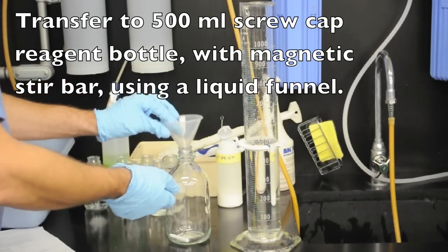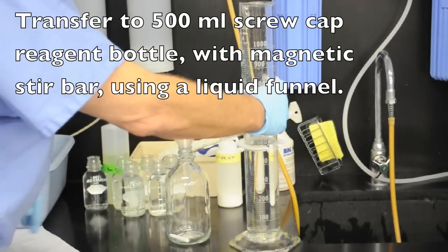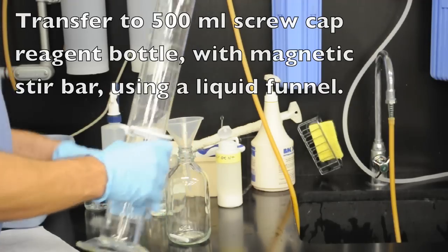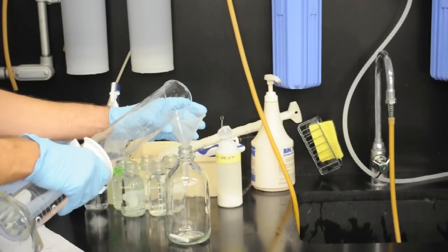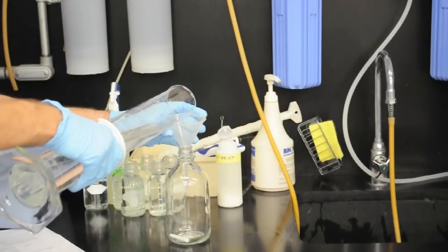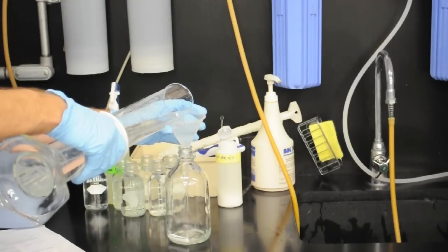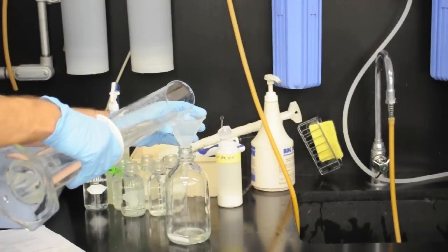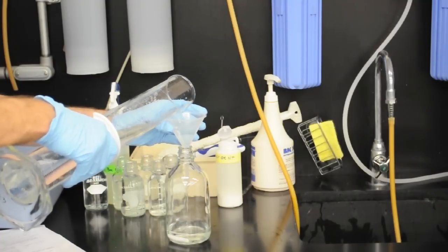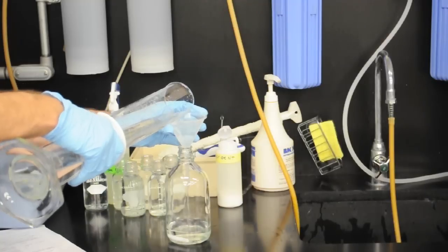Once we have our 500 milliliters of water, we want to transfer that to a specific reagent bottle. We're going to be storing this long term so we're going to use a screw cap bottle. As you can see, we've added a magnetic stir bar to the bottle and now we're just pouring or decanting the liquid into the bottle.